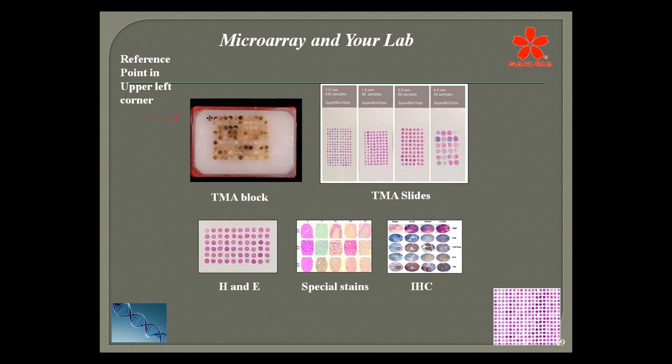We know that we use liver for trichrome. We may use gastric tissue for trichrome, or skin, or something else. So you could make nice little square blocks, if you will, or even do the cores if you choose, for trichrome staining, and get the different levels of intensity for staining, which makes a pretty good control.